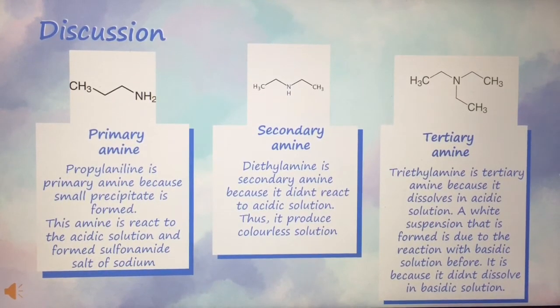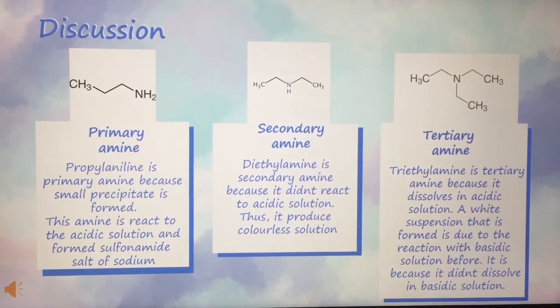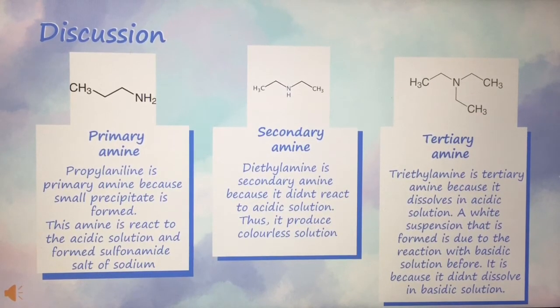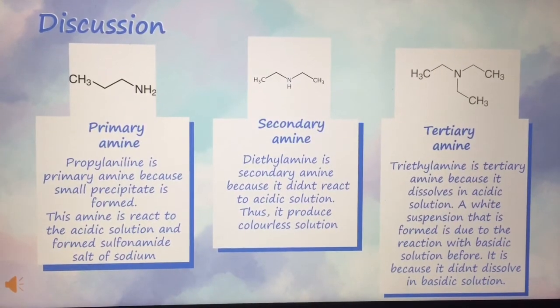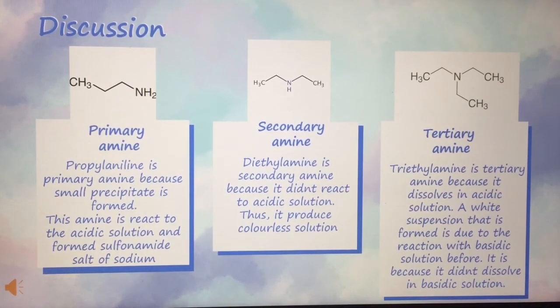Next, the third compound is triethylamine. The triethylamine is a tertiary amine because it dissolves in acidic solution. The white suspension that is formed is probably due to the reaction with the sodium hydroxide before, and it doesn't fully filtrate. So probably the white suspension was because of the reaction of the triethylamine with the basic solution before. It is because the triethylamine didn't dissolve in the basic solution.